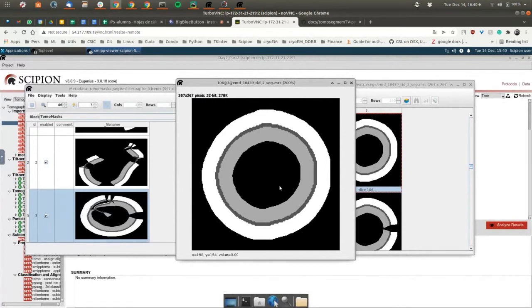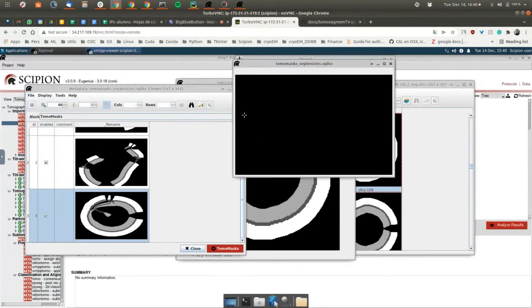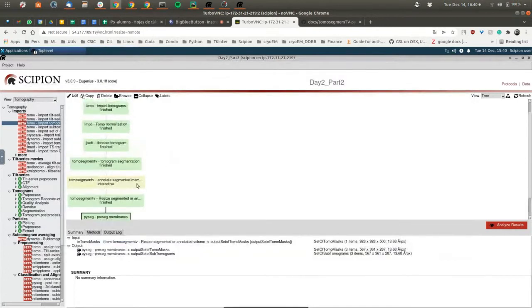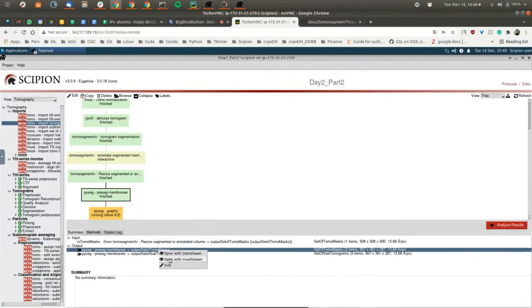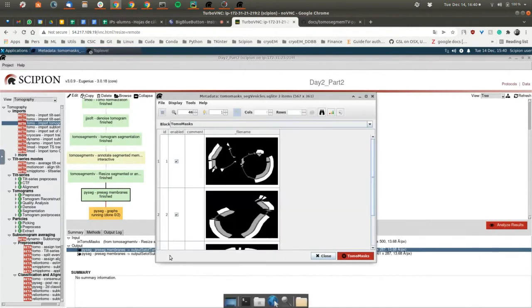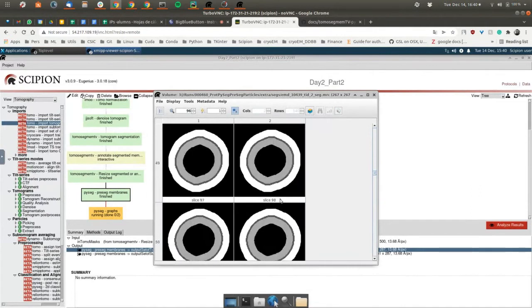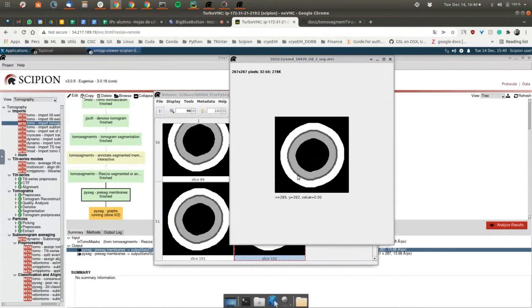At this point, you can open ImageJ. I don't know why it is complaining now. I don't know what happened. Oh, okay, let's go back. Let me go back to the previous one, because maybe I was messing something up before. Okay, this is because I'm talking and talking, and sometimes I make mistakes instead of doing things correctly. Okay.